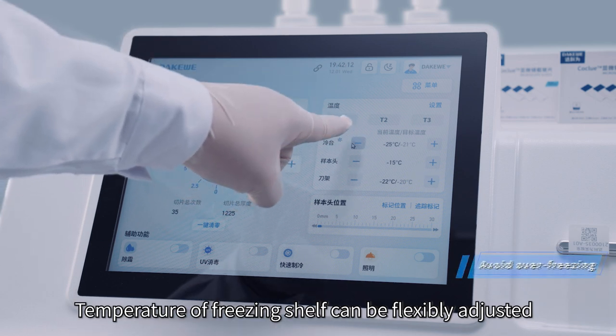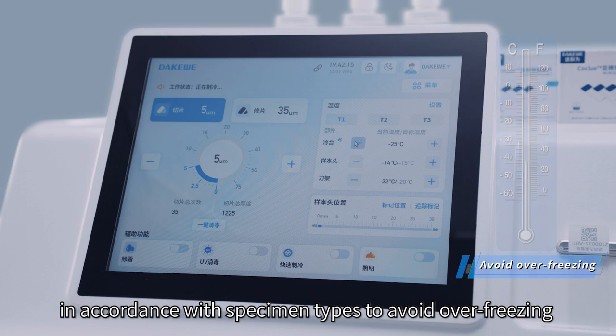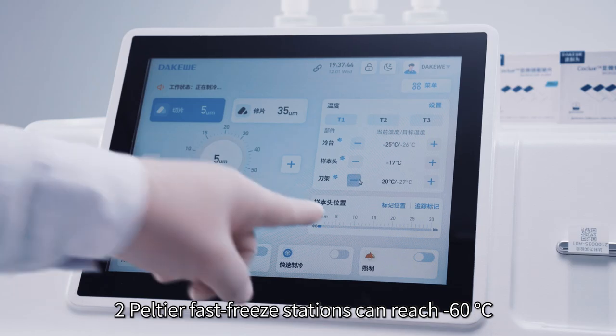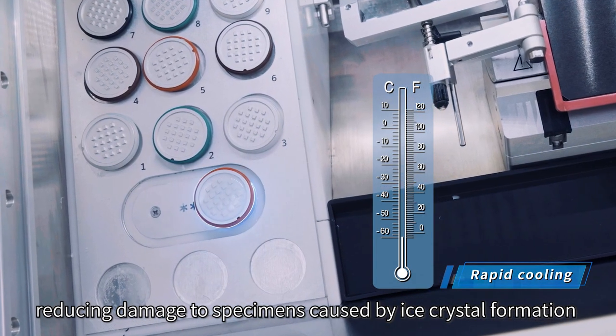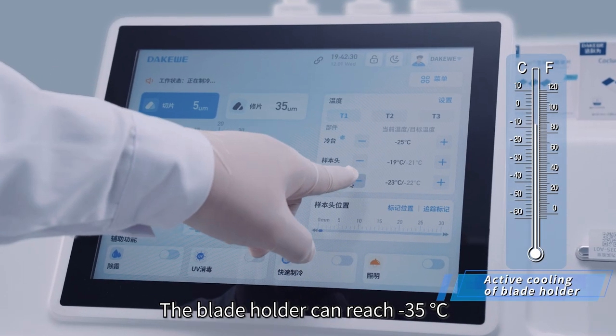Temperature of the freezing shelf can be flexibly adjusted in accordance with specimen types to avoid over-freezing. Two Peltier fast-freeze stations can reach minus 60 degrees, reducing damage to specimens caused by ice crystal formation. The blade holder can reach minus 35 degrees.